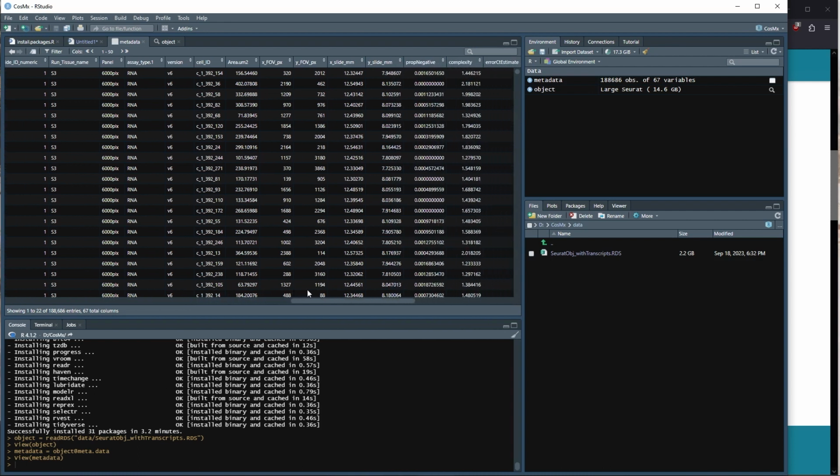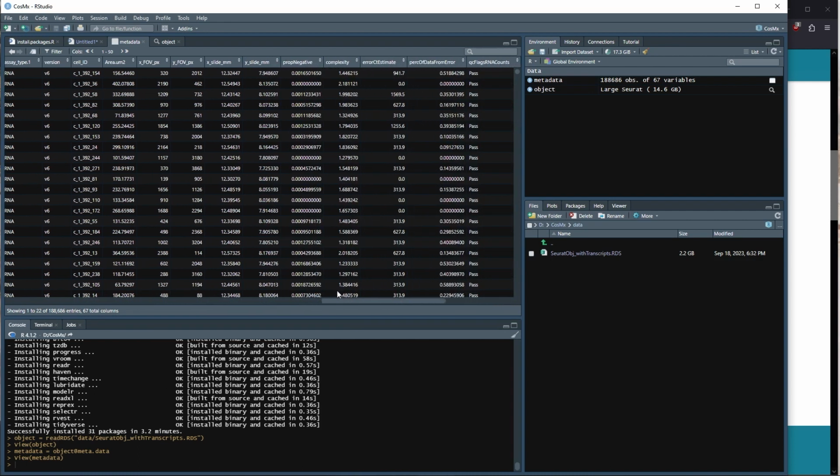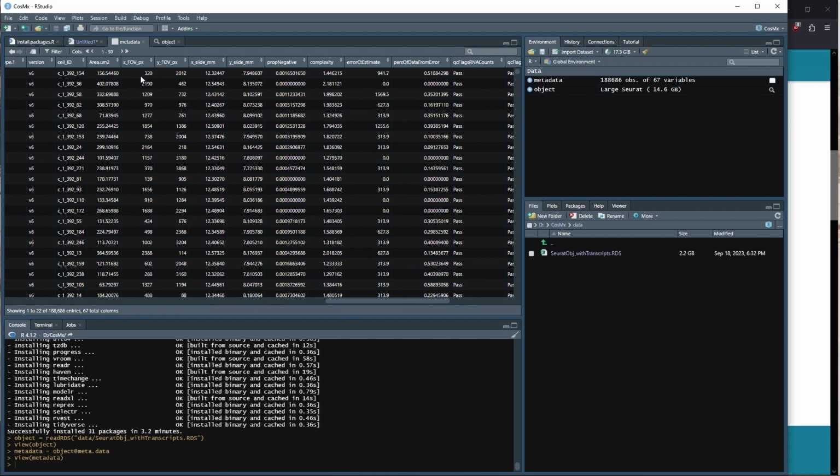There's our cell ID. What else is here? That's kind of cool. So we can see locations of cells. So we can actually do an XY plot of our different cells, looking at our fields of view. So if we subset to 100 or 1, we'll be able to see all the cells that belong to that, and then we'll be able to plot their locations.